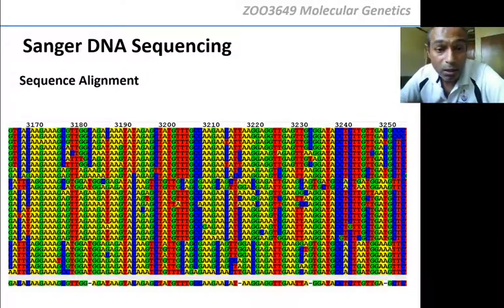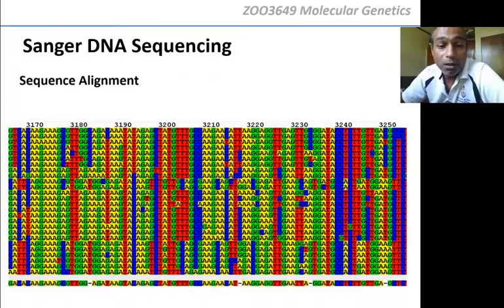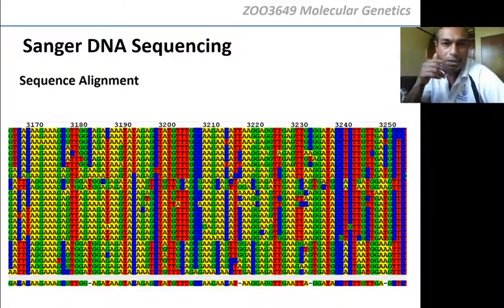Who's clever out there? You can see immediately from this DNA alignment that these sequences, there are parts of them that are pretty much the same. No? Look at here, where my mouse is. Look at these ones here. Look, everybody, no matter which individual it is, 1, 2, 10, 20, they all have this part here. This AAAG. You see? Maybe this guy doesn't have it. But you can see they're all pretty similar. They all have this T. Yeah? They all have a lot of pieces of the DNA. Like this C here. They all have it. So you can see that they have some similarity between them.